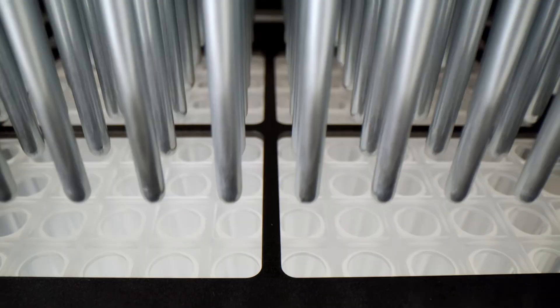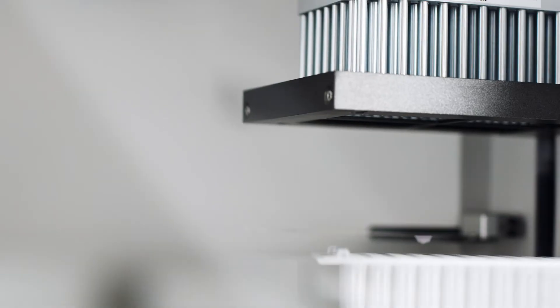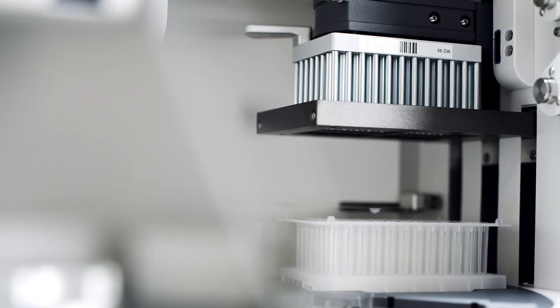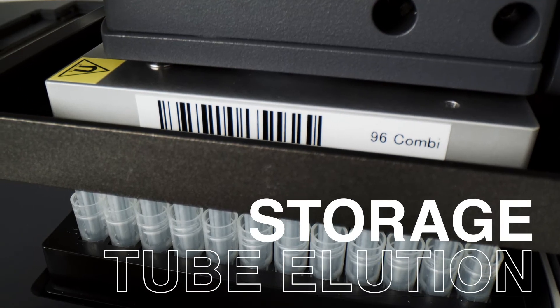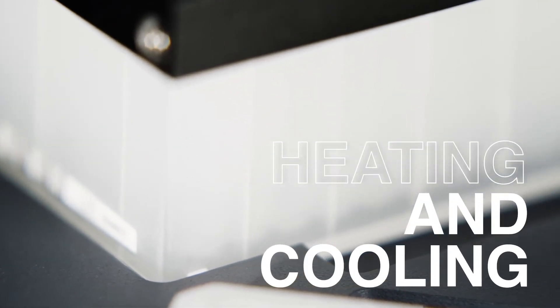Specialized tip combs and well design enable lower elution volumes, storage tube elution, and heating and cooling consistency.